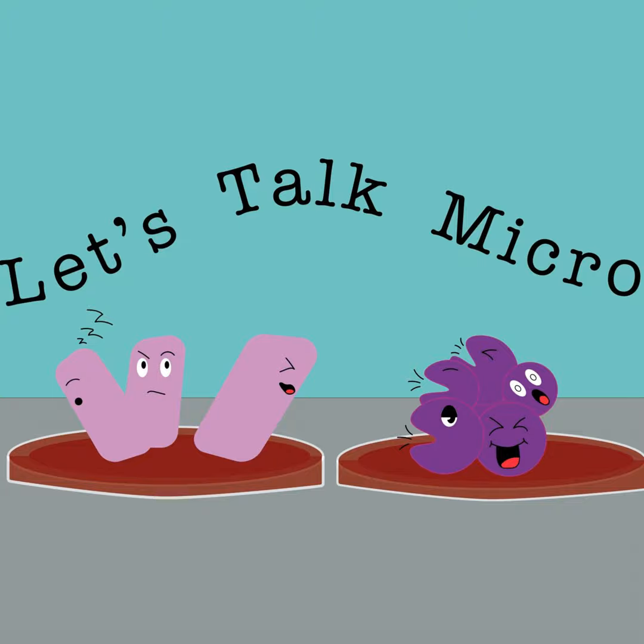And then once you have the library prepped, you have to load it into a sequencing instrument. There are different types of sequencing instruments. For us, we're using the Oxford Nanopore MinION Mark 1C. It's a small portable device that performs base calling live.